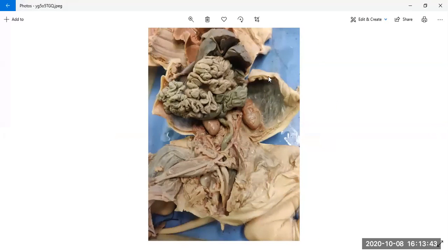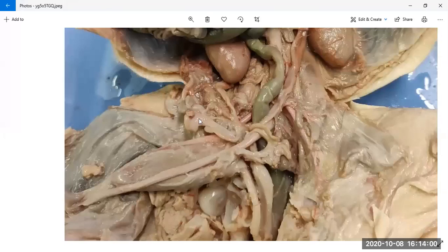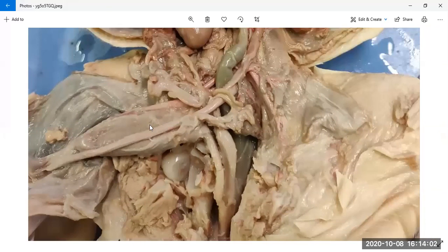I won't test you on the details, just know the big pictures like the liver, the small and large intestine, the kidneys, and renal vein, renal artery, because you can actually tell. And probably the urinary bladder, because this is a sac-like structure, and usually it has other tubes attached to it. Could be the penis, could be the ureter, but you can tell this is the urinary bladder.